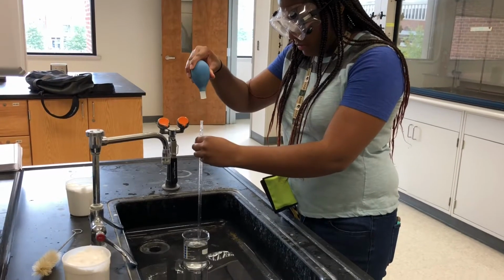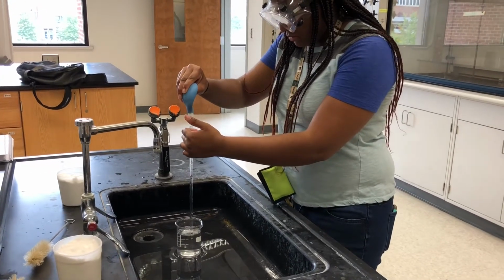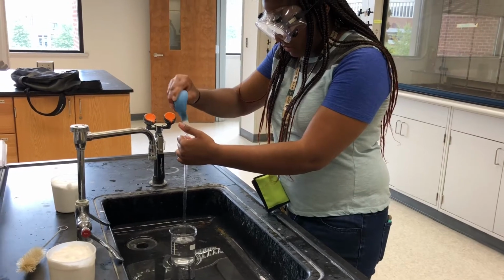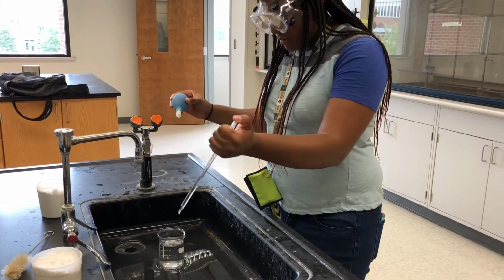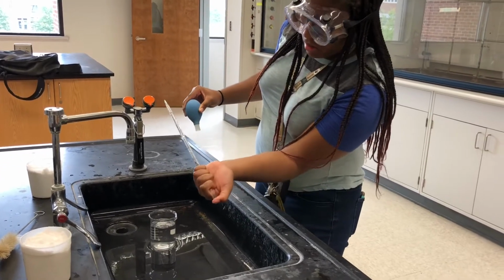Next, the pipette must be coated with the test chemical in order to ensure the most accurate results. In order to do this, an amount of the solution should be taken into the pipette, and the pipette should be tilted in order to coat the entirety. This should be repeated 3 times as before.